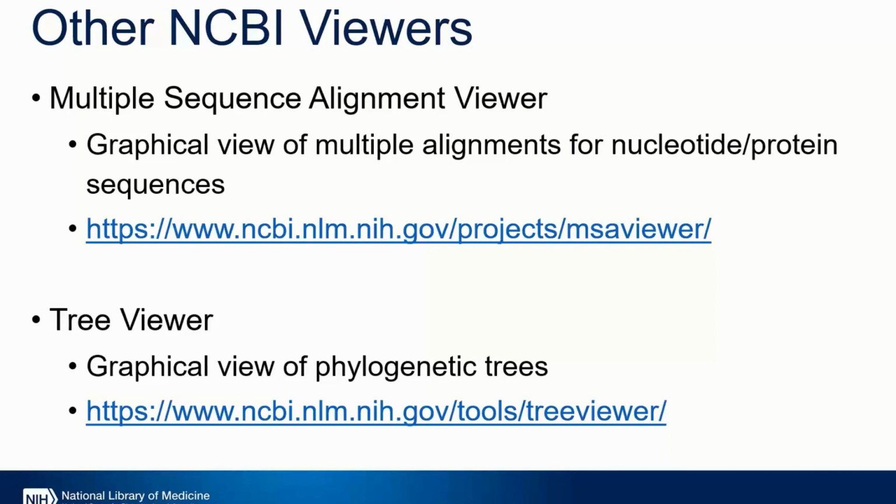And you can expect a webinar in the near future that will hopefully touch on a lot of those features for you and give you a sense of how to use them. However, there's also lots of help documentation at that link that you can use if you want to get a head start. We also do have the tree viewer if you need to investigate a phylogenetic tree. However, I'll also emphasize that if you need to, the service is also offered by the Genome Workbench.